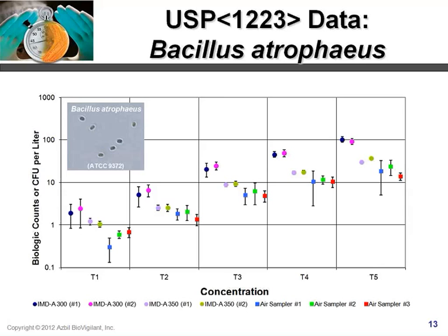And the other system on this graph, which has a flow rate of 28.3 liters per minute, is the SMA reference air sampler. However, the other 2 air samplers, the SAS and the MAS, operate at 100 liters per minute. So that's roughly 3 times the flow rate of our high flow system, and on the order of 100 times the flow rate of our low flow system.